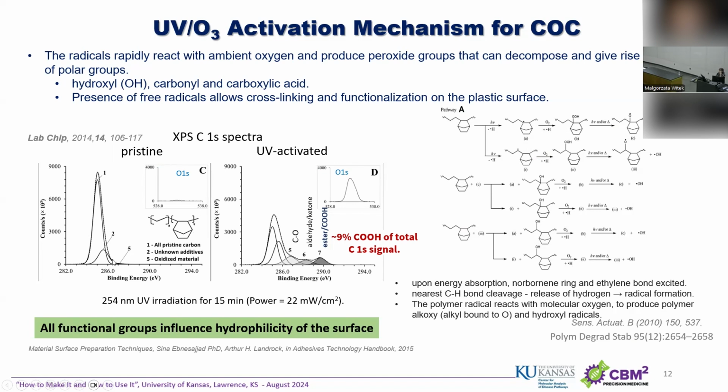And this is so nice to see and compare it after, because if you look at the structure of the COC, there is no internal oxygen in there, right? So you can see a clear rise in those oxygen-containing functionalities. If we look at the carboxy functionalities, about 10% of all the functional groups that we receive after photooxidation.